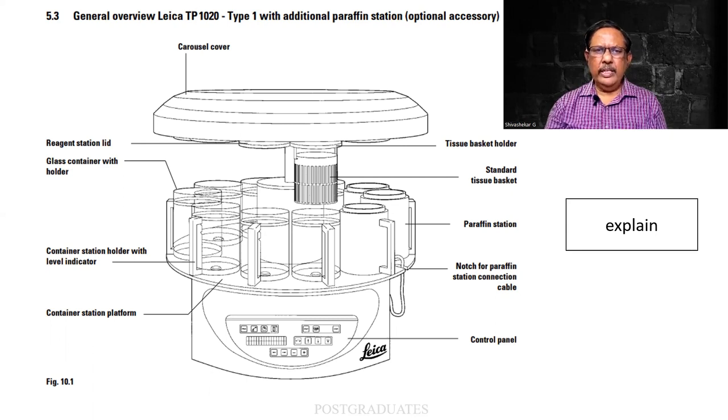So this is the Histokinette. And why is it called the most sincere technician? Because you close the lab and you go, this fellow will be functioning. And be it a holiday or not, it will continue functioning.